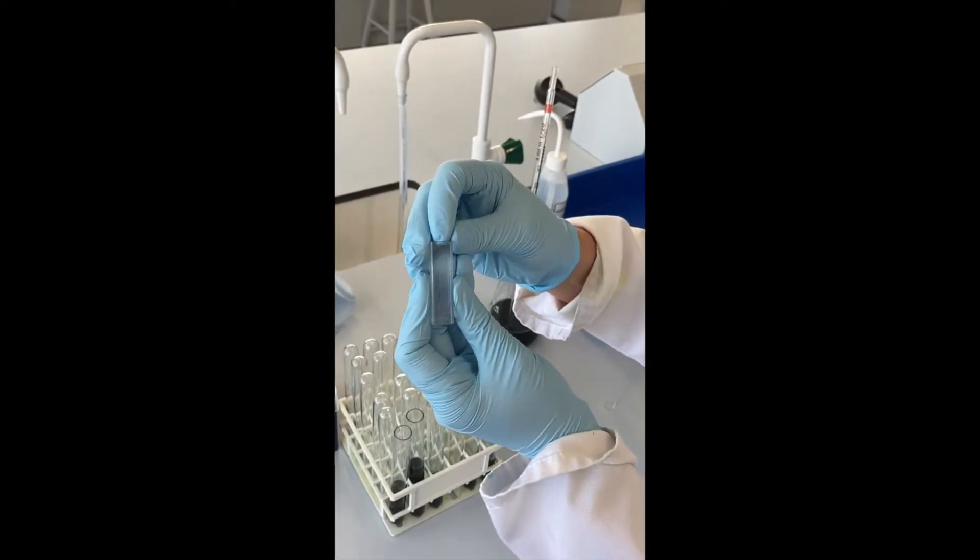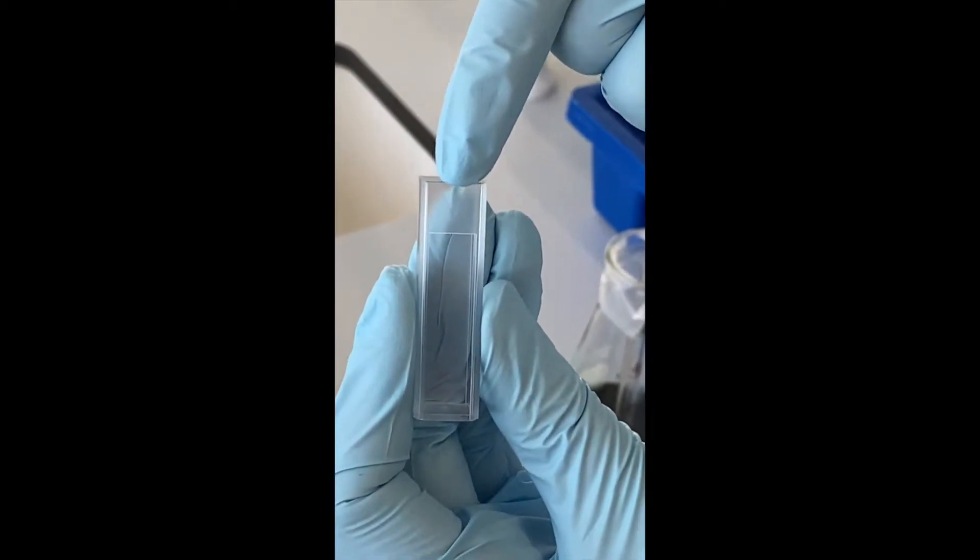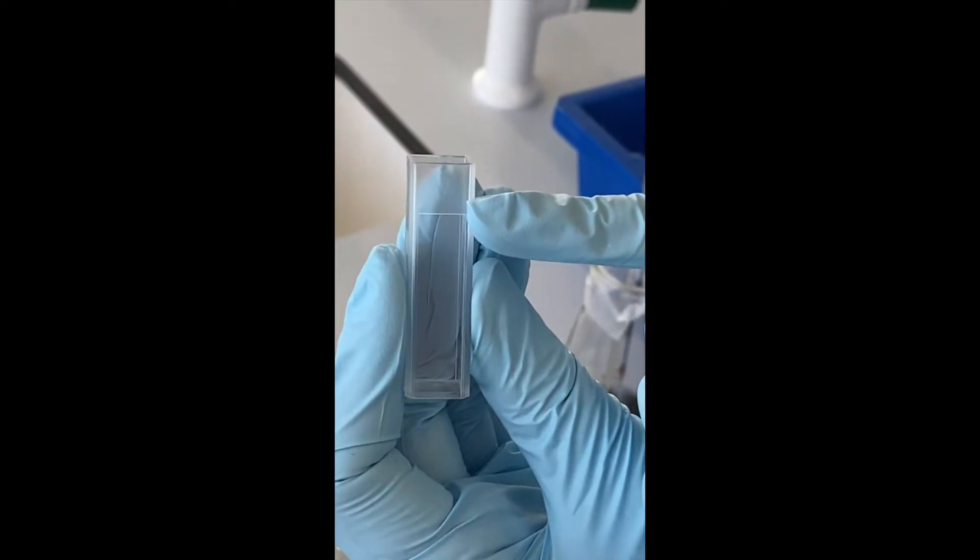The first thing you want to check is where the fill line is in your cuvette. There's a little triangle on one of the sides. To the bottom of this triangle is where you want to fill up.